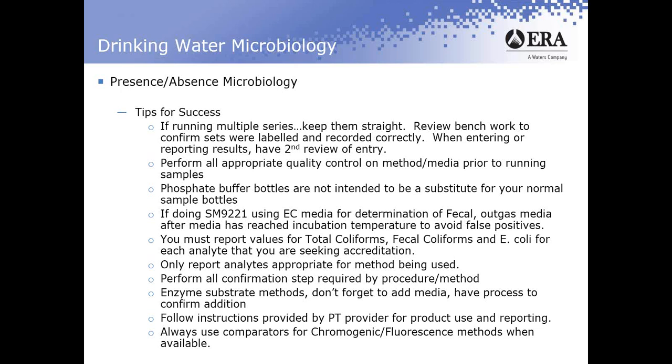With those CRMs available, you should be evaluating media, filters, pads, funnels, incubators, pretty much everything that may be involved in your particular process. You should be looking for any kind of signs of poor performance or any kind of inhibitory effects well before you actually are running a PT. So you want to make sure that that's happening.